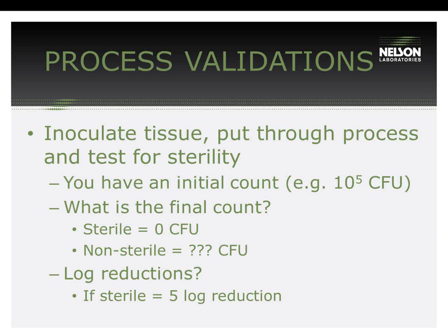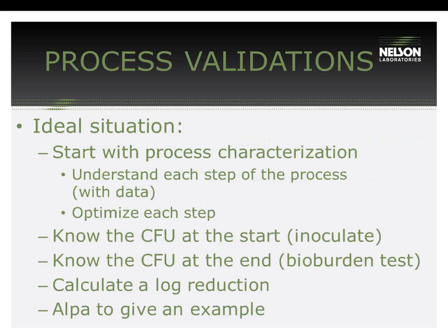If all the samples come up sterile, or if only a couple of them grow, then you can calculate a log reduction. But you're hoping that you get all no growth to take this approach in order to get information you can really work with.